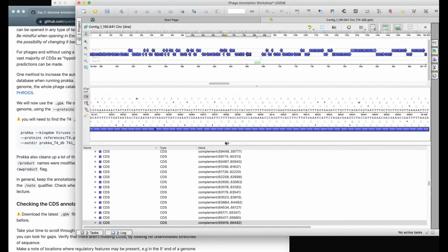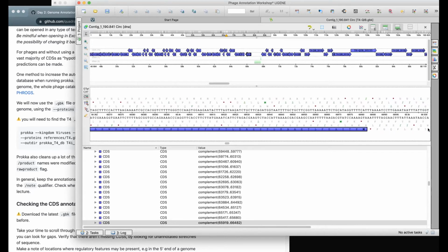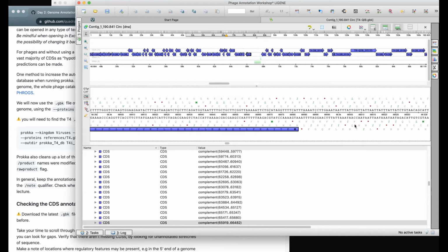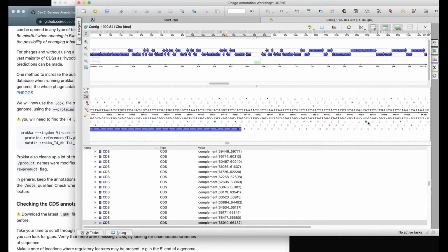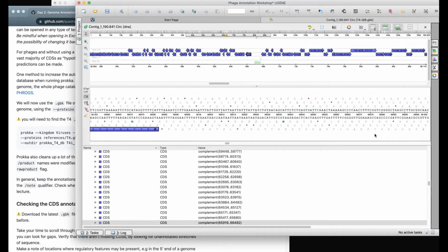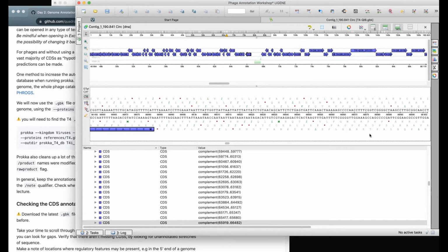There's no way that I can extend, so that's not a thing that I need to look for. There's also a good ribosome binding site predicted, so I don't have to worry about this. So then it's a matter of looking in this empty section whether there is a longer frame that could be something.